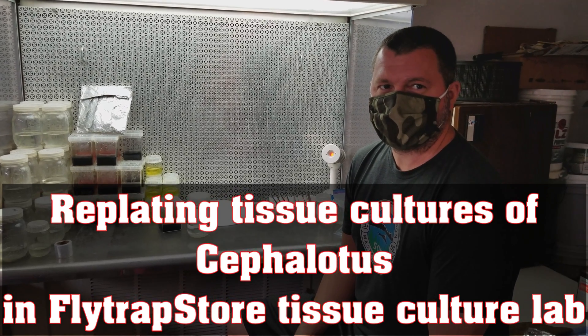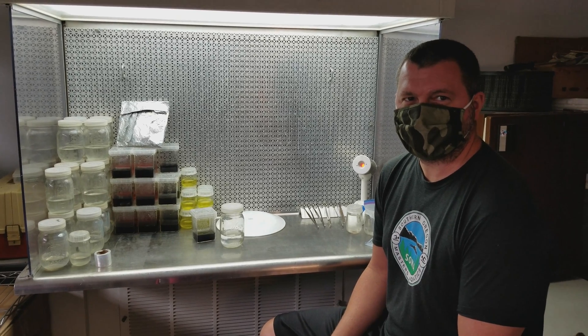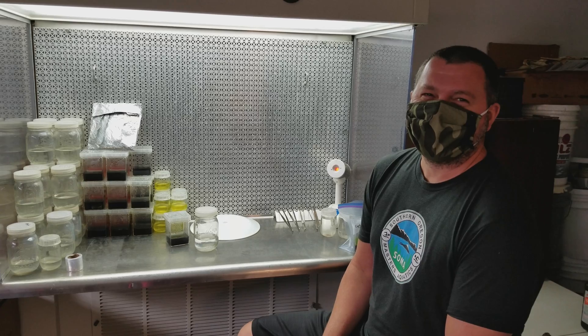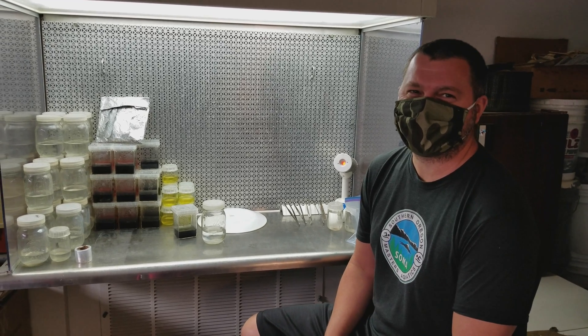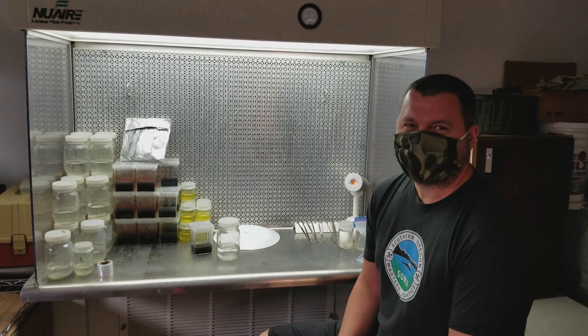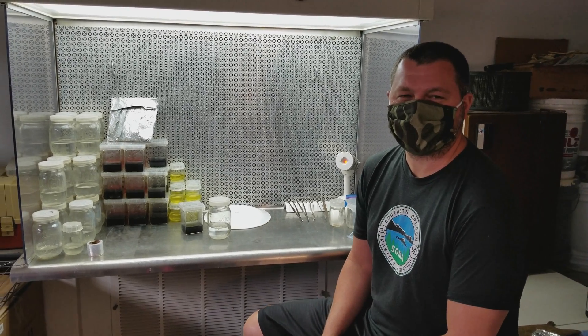Hi everyone, it's Leah and Matt at Flytrap Store, and today is what we call tissue culture time. Matt's wearing a mask because he doesn't want any of his droplets to go into the flow hood here, which is what's behind him. He's going to talk you through some of his procedures today.